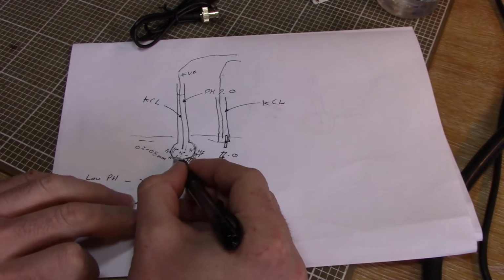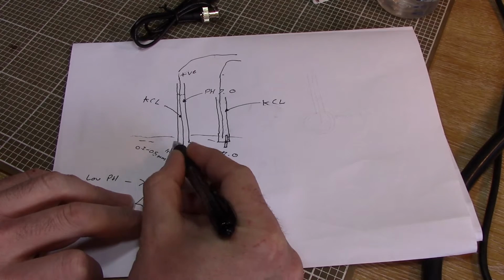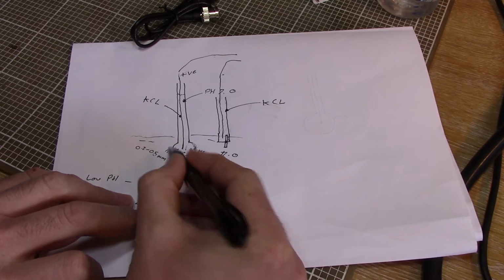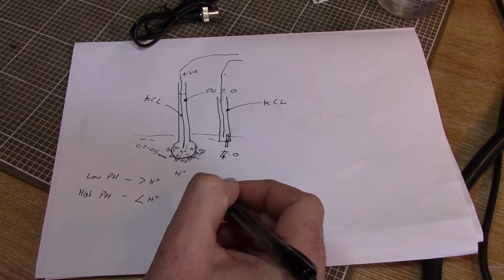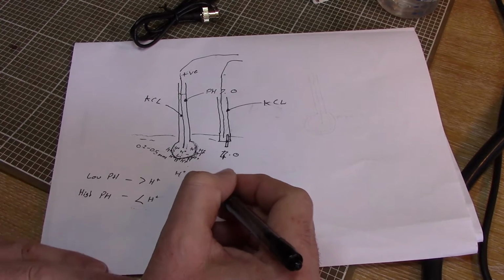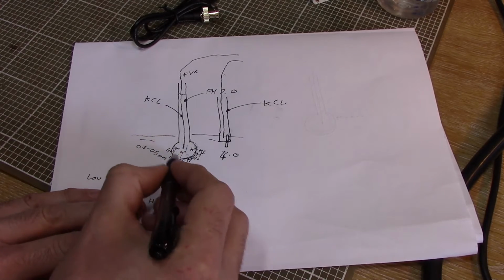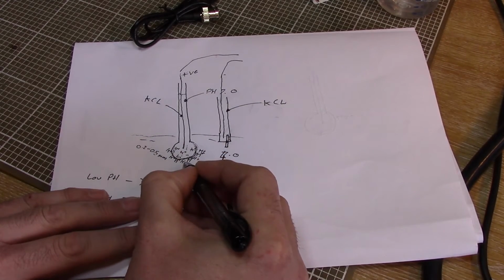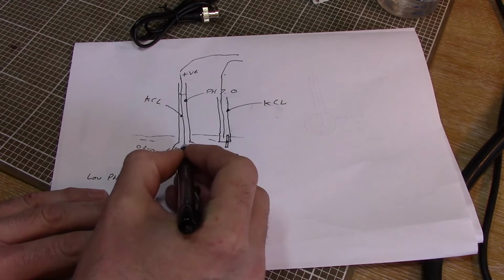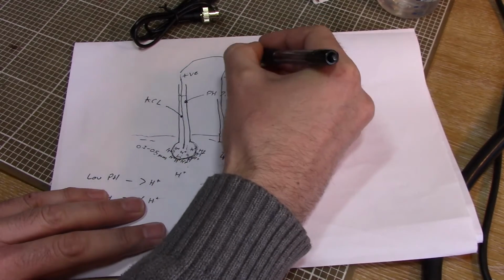he explained to me that because they've doped this glass ball with lithium, this is actually ever so slightly conductive, in the range of 500 megaohms, some ridiculous resistance, more than a multimeter can measure. But this is a very high resistance layer, and basically these charges on the outside can make their way through to the inside, and then we get a voltage across this wire and we can actually measure this.